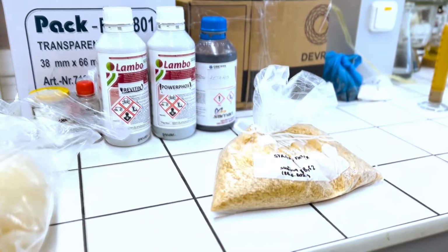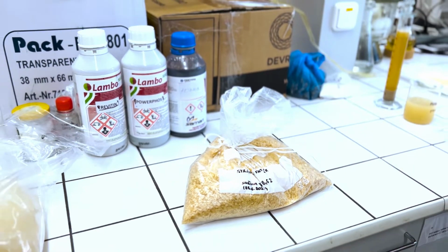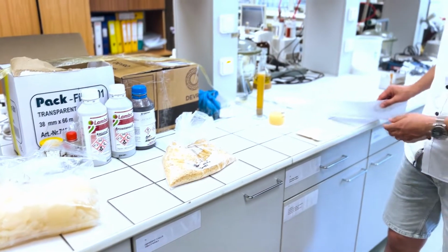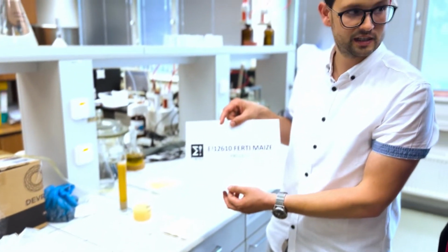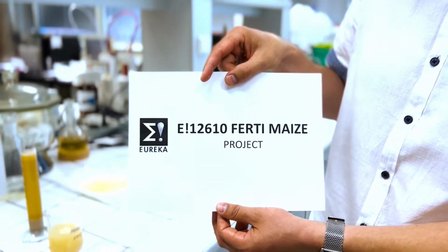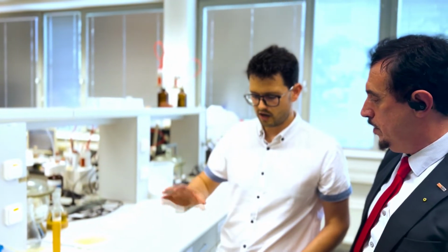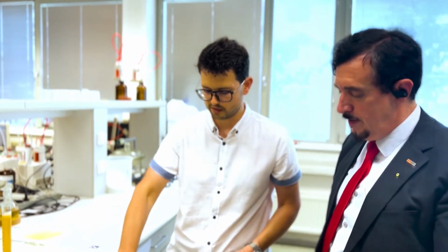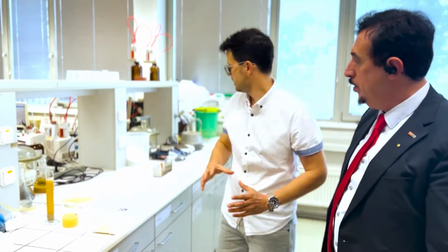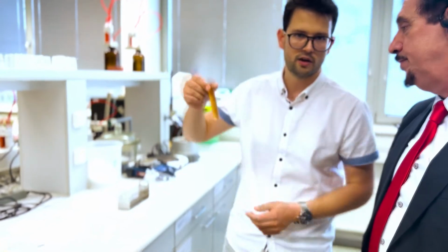There are several possibilities how to process this waste. We can start with crushing of this waste before. This one is crushed. However, I would like to focus on this specific project. We cooperate with Romanian partners, the company Probsdorfer, and also the Footwear and Leather Research Institute division from Romania, and one Czech company. Our aim is to use any waste from sausage casing manufacture together, this one, this one, all together, to process it in order to produce an organic fertilizer.